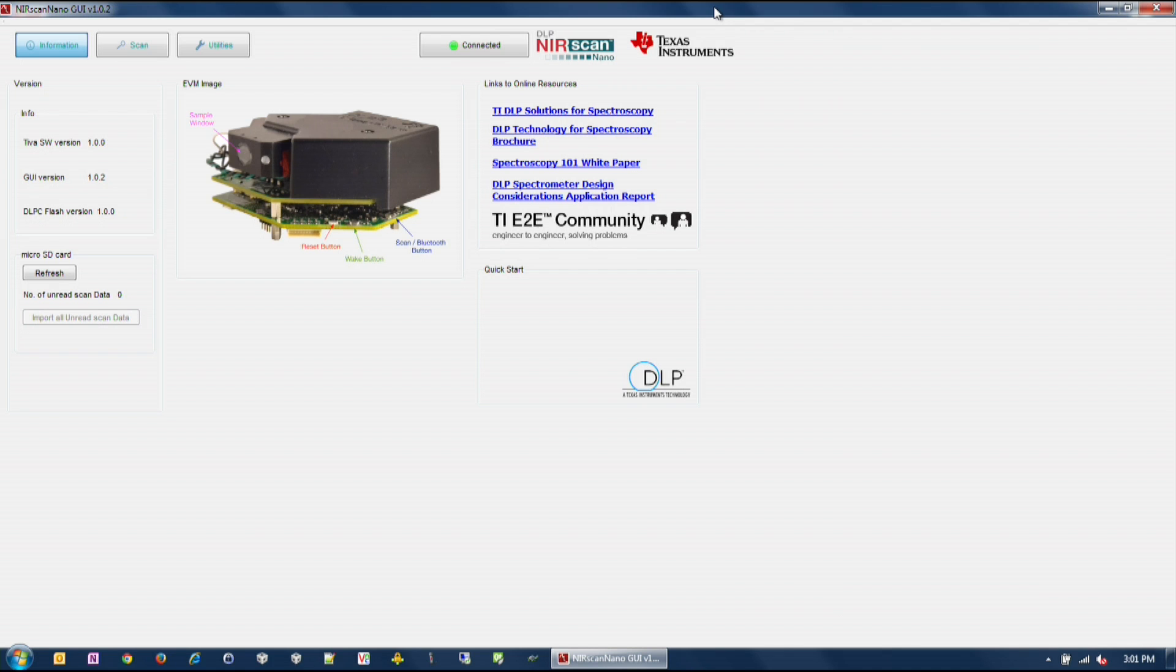The GUI is divided into two sections. The top section shows the connection status button on the right-hand side that displays the connected state of the DLP Nearscan Nano EVM. The light will turn green when the EVM is properly connected.